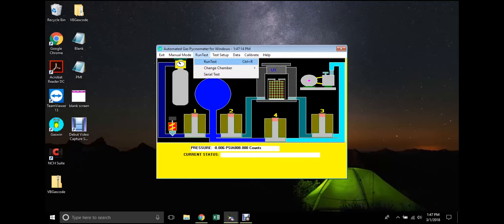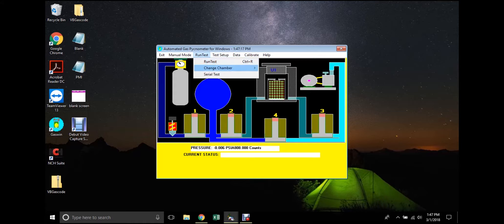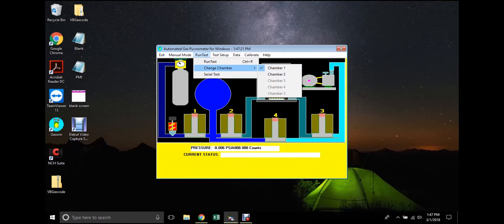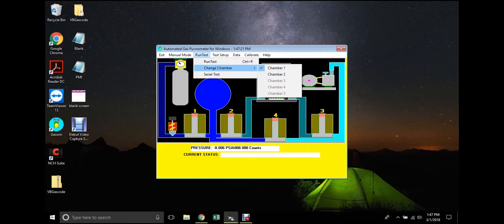Return to the computer with the software open and click Run Test on the menu bar. If the user is operating a model with more than one sample chamber, there will be an option to switch between them. Select the desired sample chamber and then click Run Test in the drop-down menu.